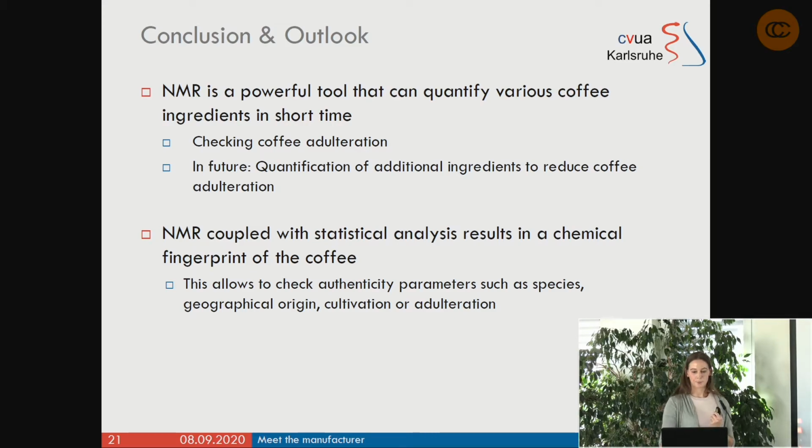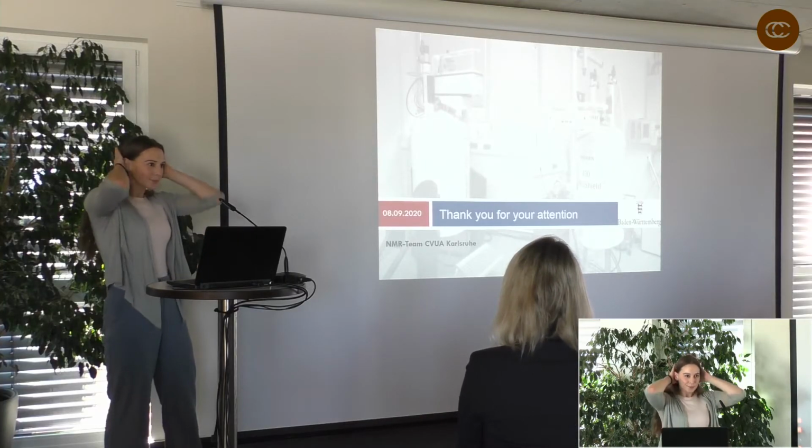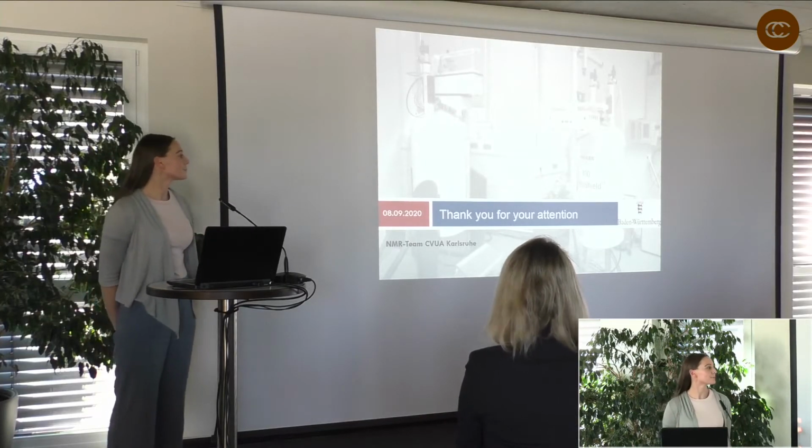But it is very important to measure a large number of different coffees so that the whole variance, such as a different roasting profile or the use of different subspecies, can be detected.